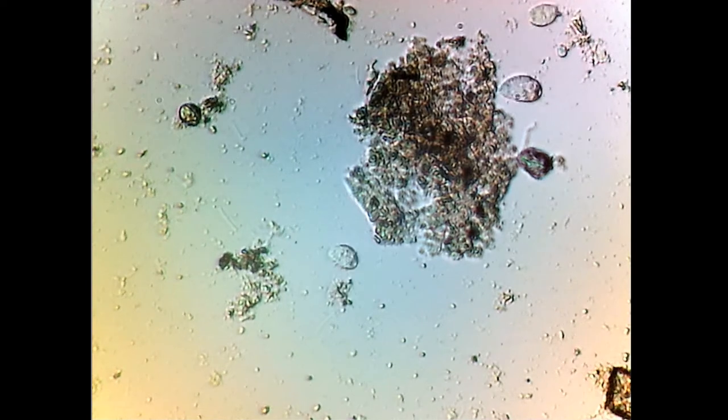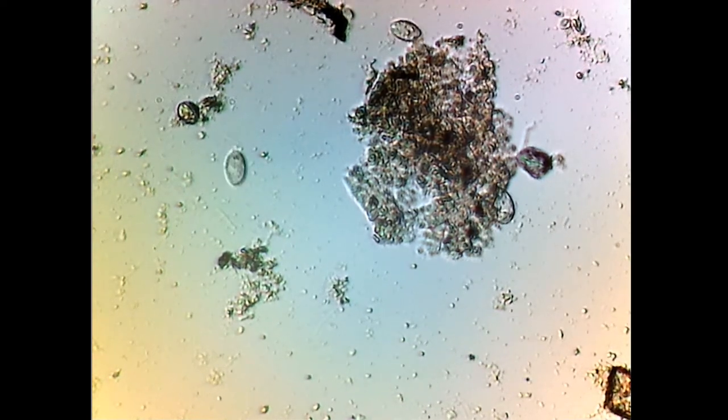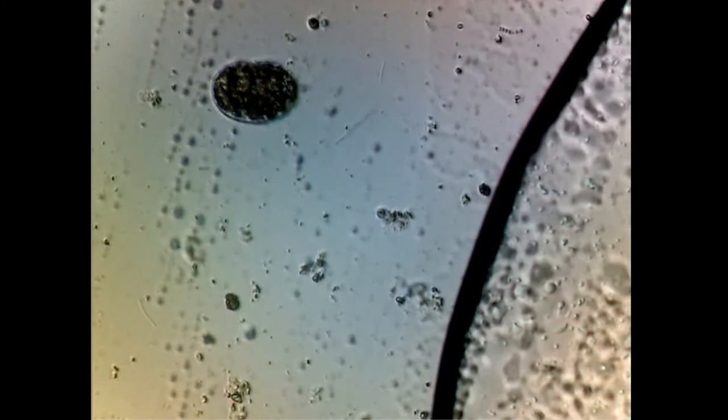And just to give you an idea how small these microorganisms are, for comparison I'll show you a picture of human hair. It was taken with the same microscope. Now you know how small these microorganisms are.